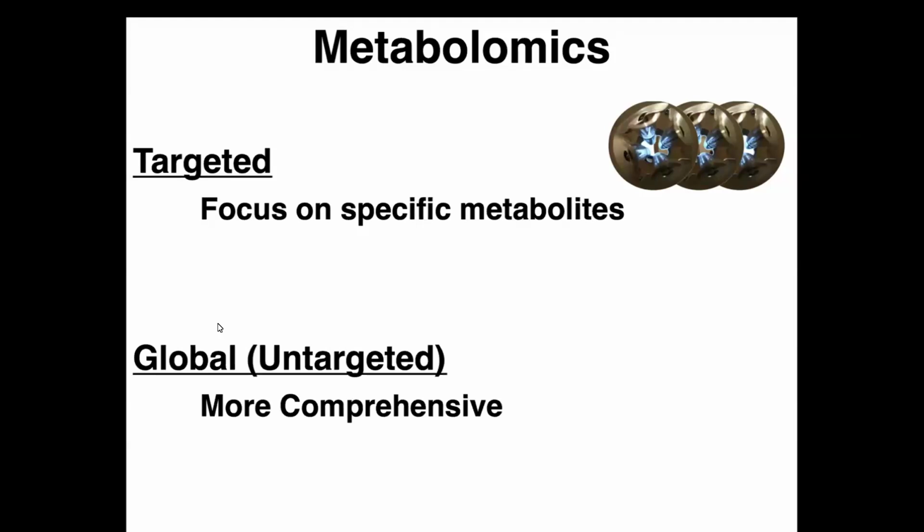I particularly like this area from an activity metabolomics perspective because in activity metabolomics, we're ultimately trying to identify molecules that have specific biological activities. And you can't always predict, as has been shown on multiple occasions in our lab, what molecules are going to be active. So the nature of a targeted-based approach is that you pick molecules you're going to look at, and you look for up or down regulation, and then try to make decisions as to which molecules are the most interesting from a biological perspective, and you start testing them.